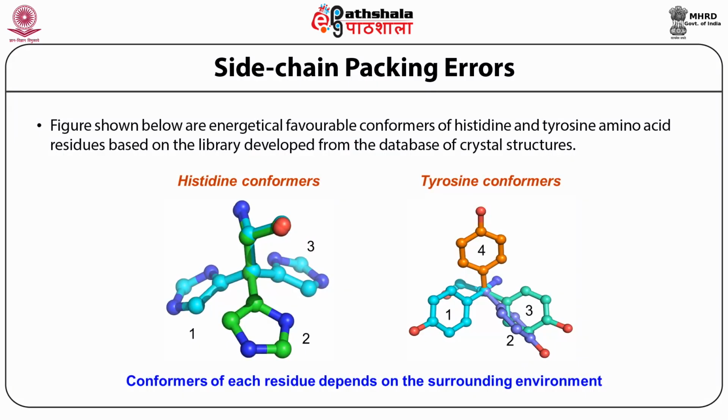So we were discussing the gauche plus 60, gauche minus 60, and trans 180 conformations of the side chain rotamers. Let's see an example. In this figure you see two examples: the histidine conformers and the tyrosine conformers. The figures shown below are all energetically favorable conformers of histidine and tyrosine residues, based on a library developed from a database of high resolution crystal structures. Histidine has 3 conformers and tyrosine has 4 conformers.